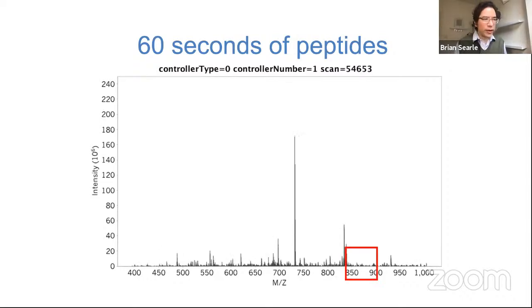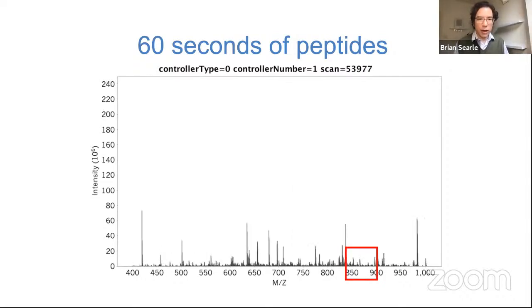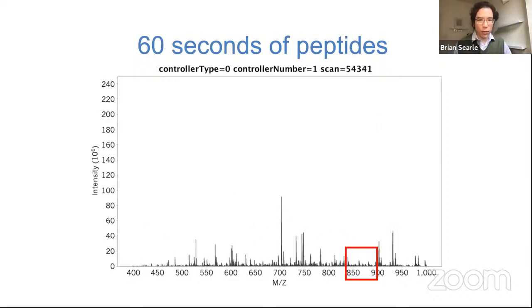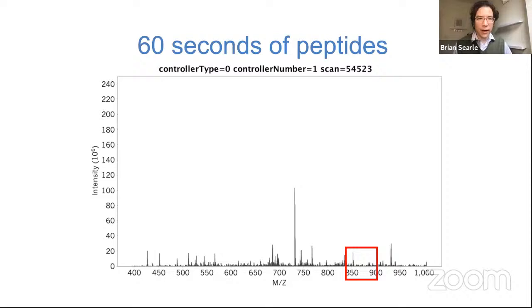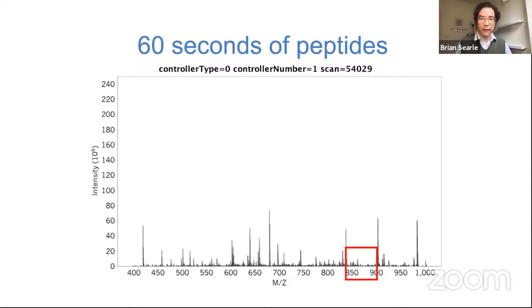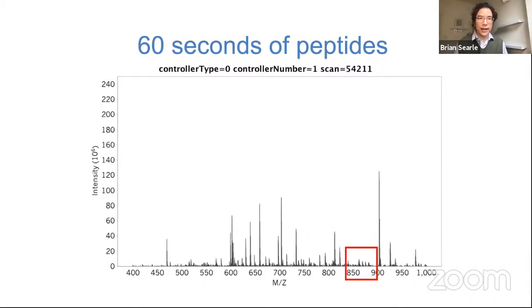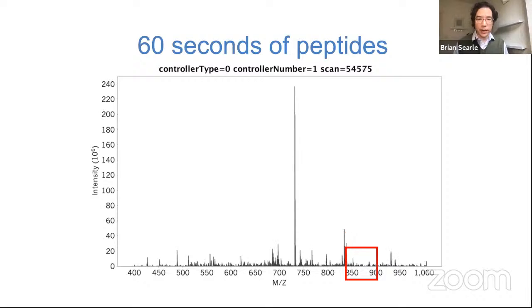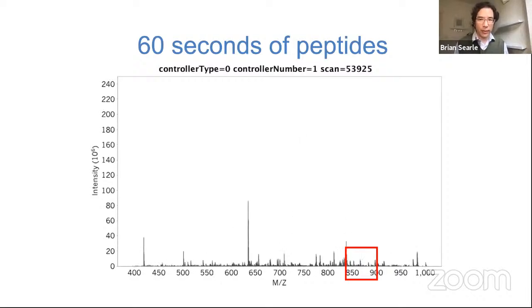And there are some regions of this proteome where you see these peaks that rise up and down, that look like normal peptides, but they're just never going to get to the threshold at which we would ever try to send them for a sequencing scan. So there are lots of these types of peptides that are really valuable things that we'd be interested in detecting that we just won't ever be able to see.